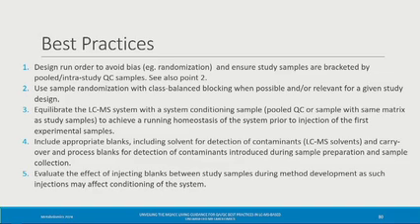Yes. So my question is whether to just do a non-biased randomization that you can, or whether you really need to make sure that, if you have 25 variables that you collected, that would be challenging. So if you have a small sample size, that's easy. If you have, let's say, an epidemiological study with 1,000 samples, it can be difficult. That's why I'm saying it can be a best practice, but to put it as a minimum is probably too stringent.